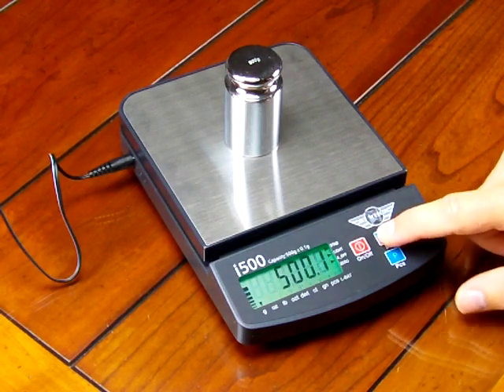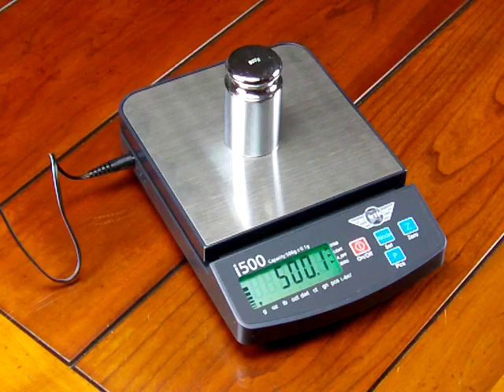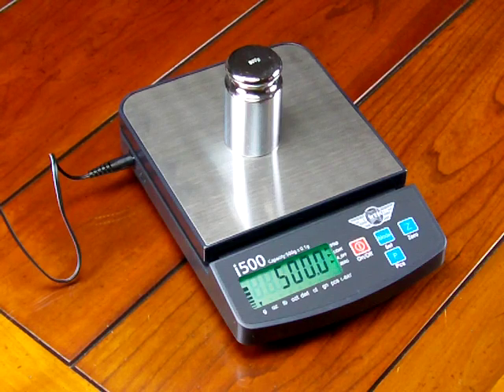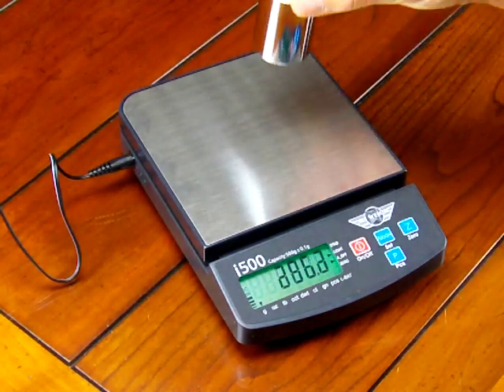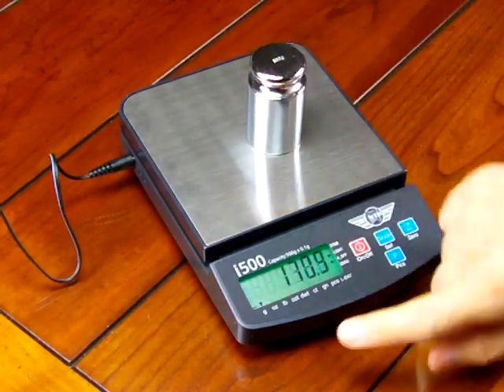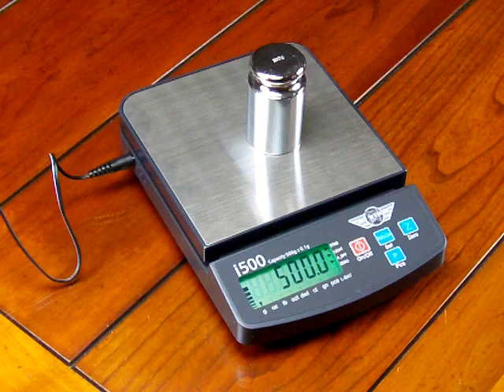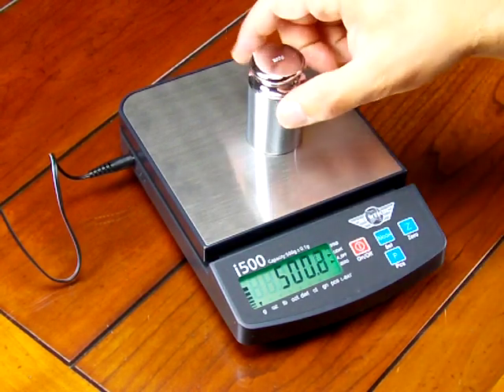Another feature I'd like to show you about the MyWay i500 is on the left-hand side of the display we have this weigh meter. The weigh meter on the display is a series of bars, and as the load increases and decreases, these bars go higher and lower. This gives you an idea of how much weighing capacity you have left in the balance.